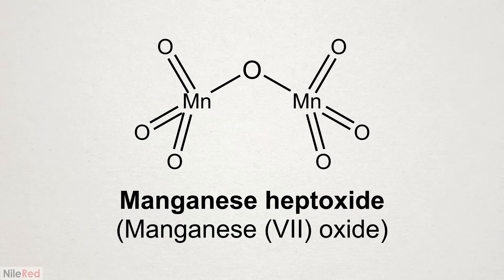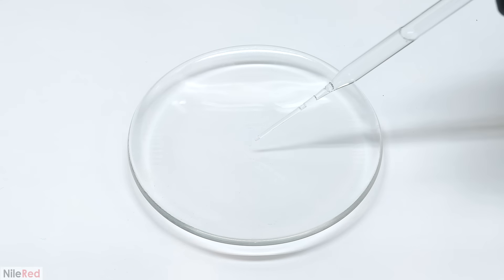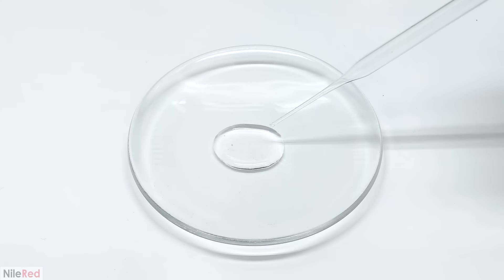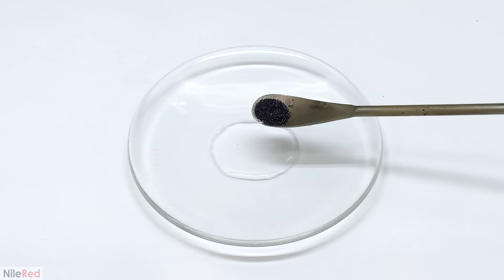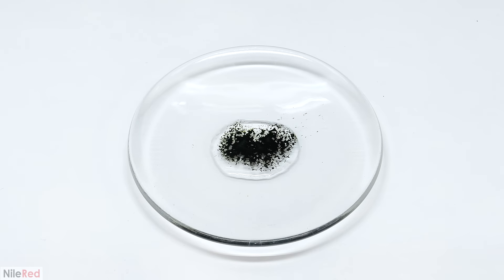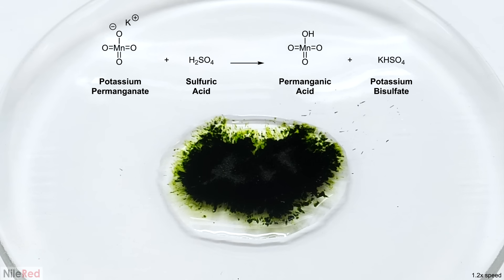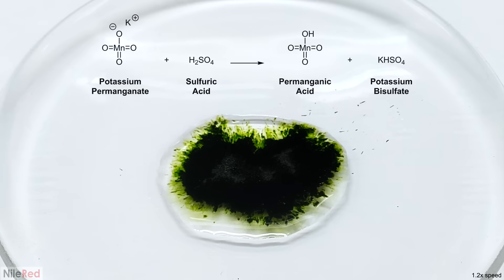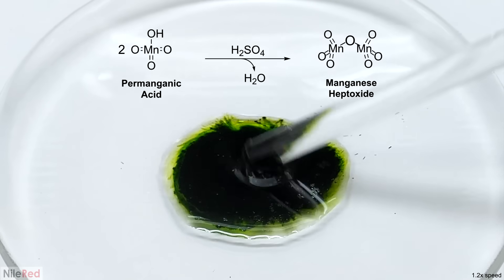To start things off I've decided to go with something called manganese heptoxide. Manganese heptoxide is nothing new and it's been known to exist since at least the mid 1800s. It's made by mixing two relatively common chemicals — the first one is concentrated sulfuric acid. I like to add a pipette full, which is about two milliliters, and then sprinkle on a small amount of potassium permanganate. The moment they're mixed, the sulfuric acid reacts with the potassium permanganate to make permanganic acid.